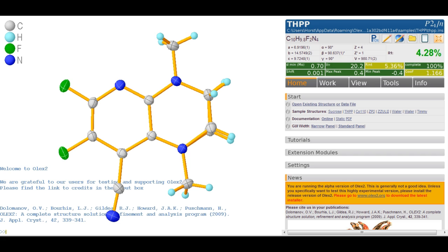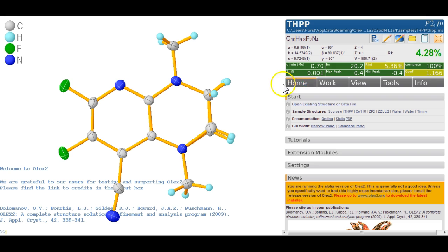Now this is the sample that we ship. It's the THPP sample in start, so if you want to follow this at home you can load that sample up.